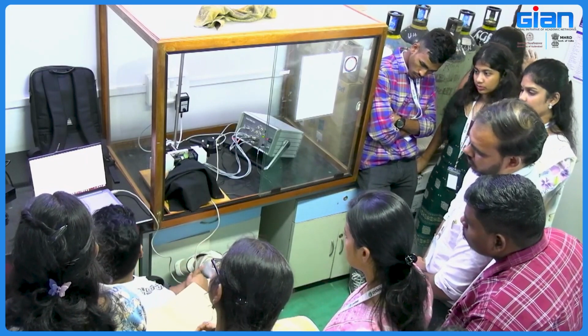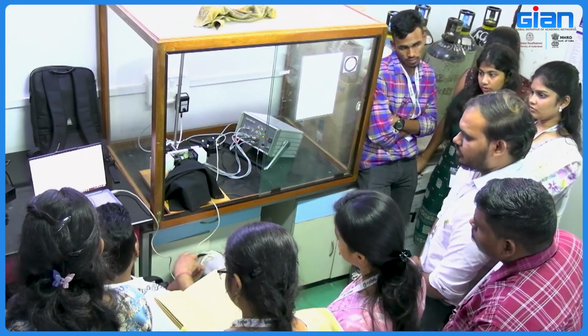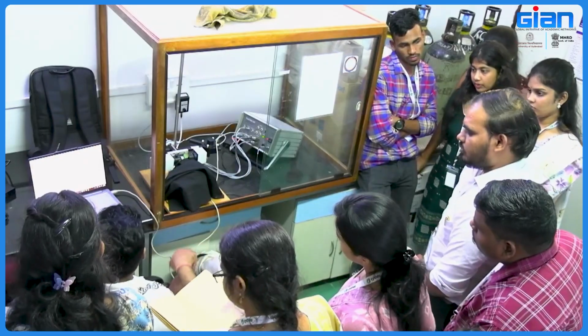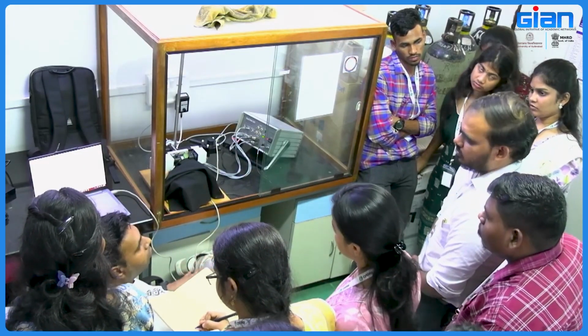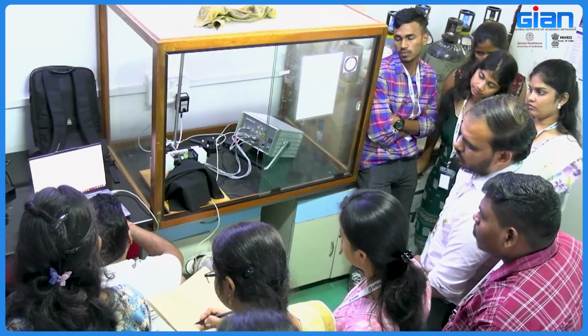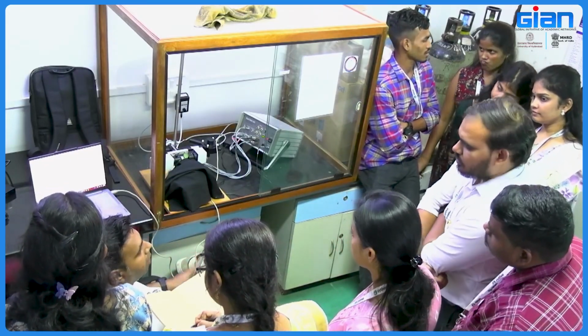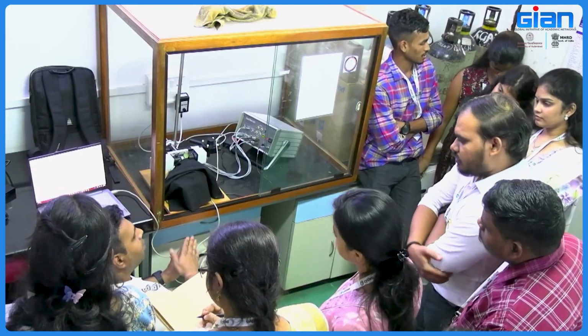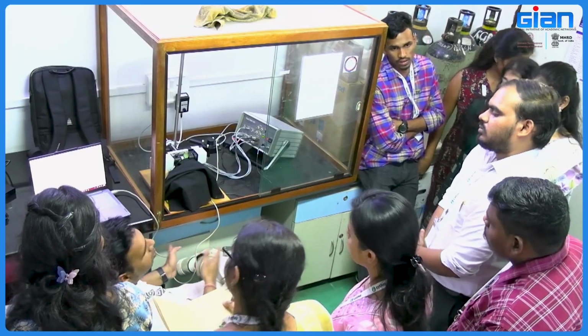PS2. Okay, so PS2, what parameters are there? One is Y2, second one is YNO, third one is YNPQ, then comes your QP, QL, QN and NPQ by 4 and ETR2. NPQ by 4 you usually don't plot. So if you go to QP, this is your photochemical quenching coefficient. The plotting will be just like your yield.